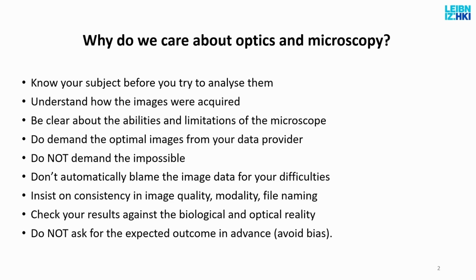So there is your responsibility as an image analyst, and then there is the biologist's responsibility. And our idea with JIPipe was, as Thilo explained, that you would be the same person for both tasks, take your microscopy data, but also be able to get quantitative information out of the data. And this is very important, not only because then you don't always rely on somebody else's help, but also because you design your experiments differently once you know exactly what is going to happen to your data.